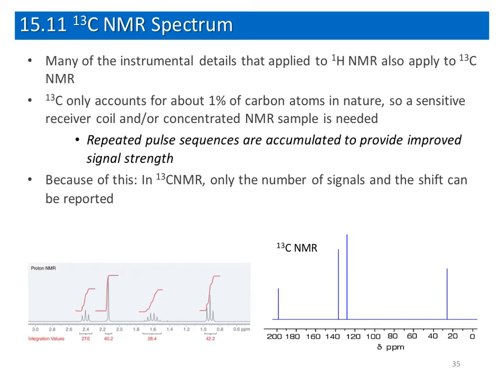Another piece of information that we can get from carbon-13 is about chemical shifts. This can give us some information about the environment again. We see carbons that are attached to more electronegative atoms appear at higher ppm, so somewhere right here. The scale is very different in carbon-13. Here we go from 0 to 200 ppm. In proton NMR we go from 0 to 12, but we still get almost similar information. So if we see a carbon is further downfield, we can expect that it's connected to oxygen, bromine, nitrogen, or any other electronegative atom.